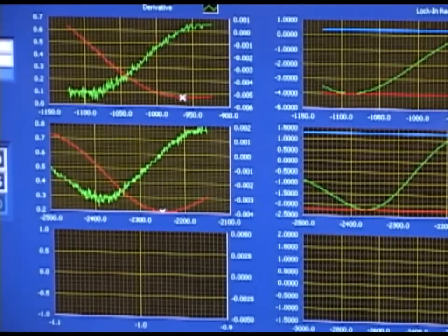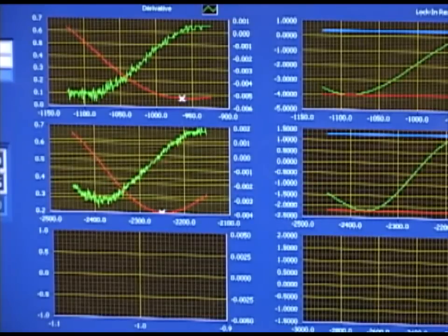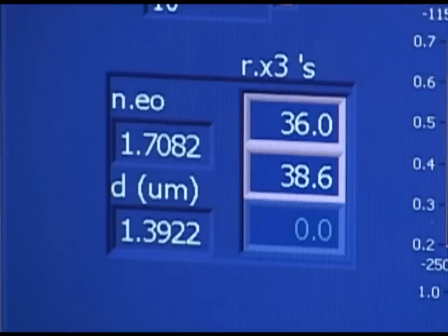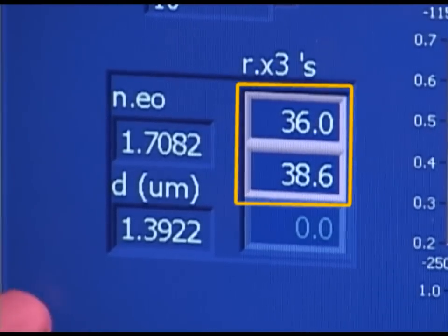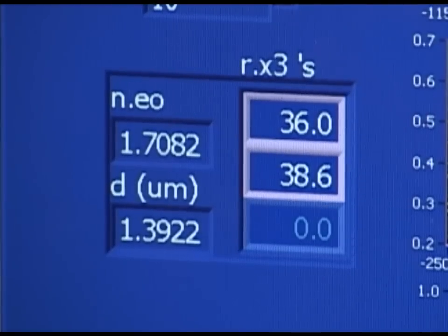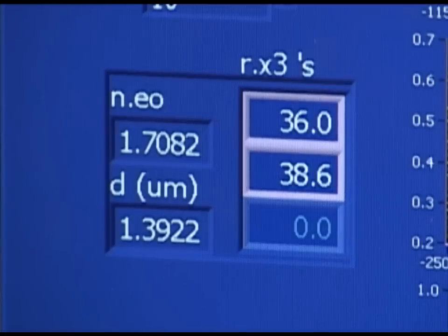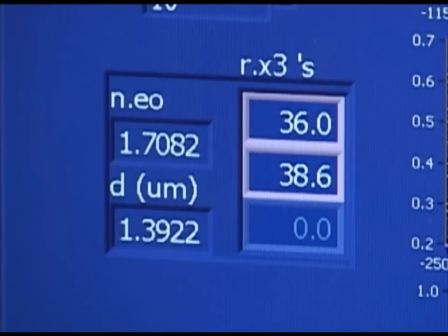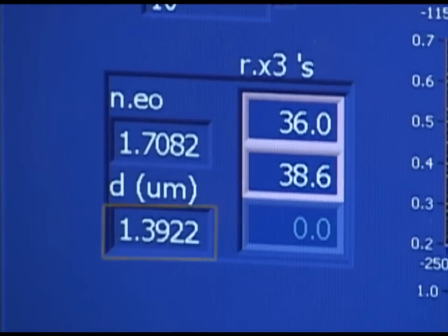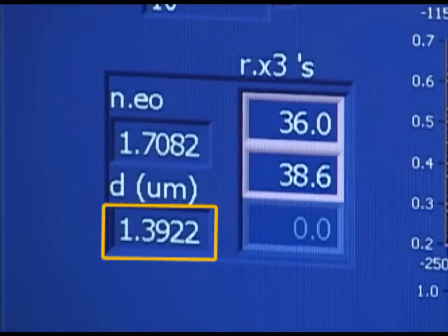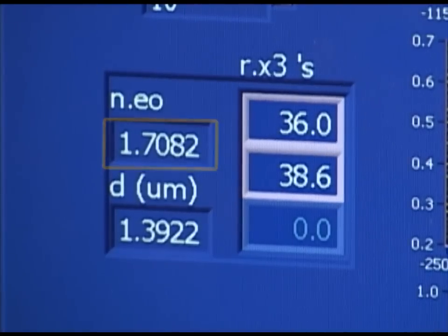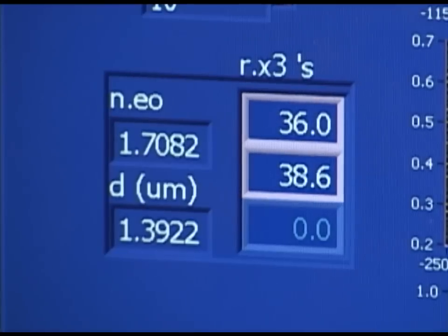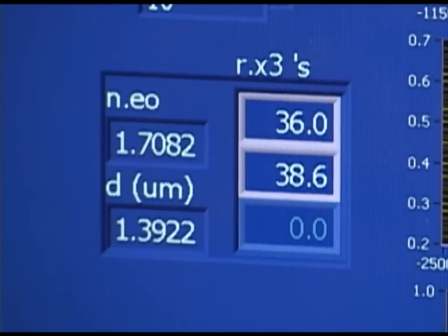From this fit, we can conclude that our values for R33, refractive index, and thickness are now correct. This sample reports R33s for each mode to be 36 and 38.6 picometers per volt. That's a relatively close agreement, so we can guess that the R33 is thus somewhere around 37 picometers per volt. The thickness it reports is 1.39 microns and the refractive index is 1.7. This data seems logical and the fit looks good, so the fitting process is now done and these values can be recorded.